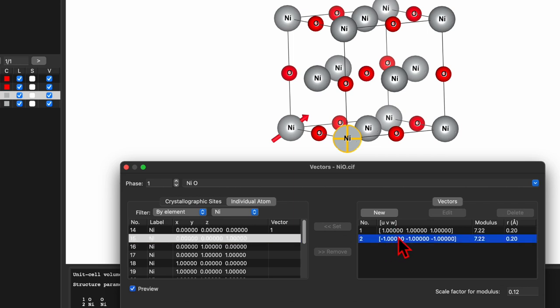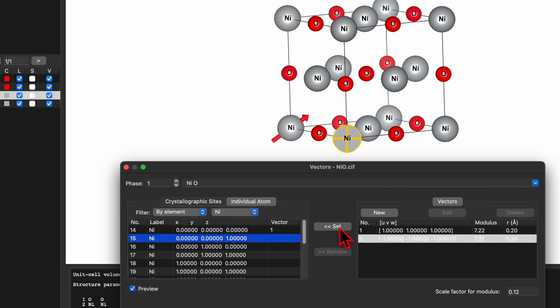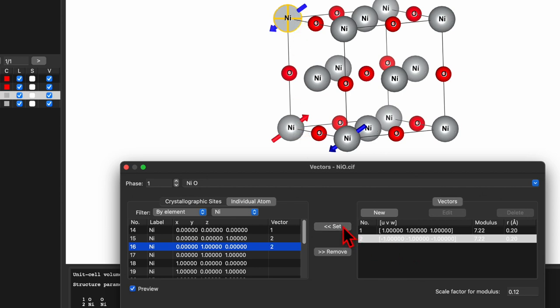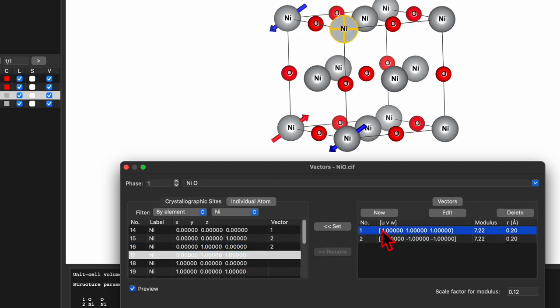Select this vector, select the atom, and click Set. You can see the arrow with blue color pointing in the opposite direction to the red one. Now select atom 3 — this atom is at the top at position 0 1 0, which is the next-next neighbor of nickel, so it should have a direction opposite to this one, meaning the blue vector. Click Set. For the last atom, it should be red.